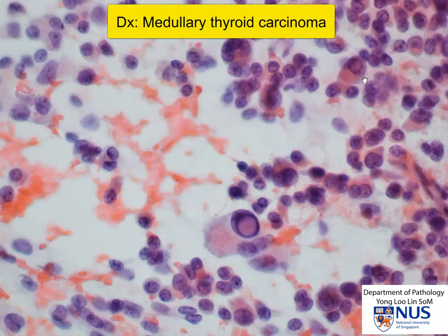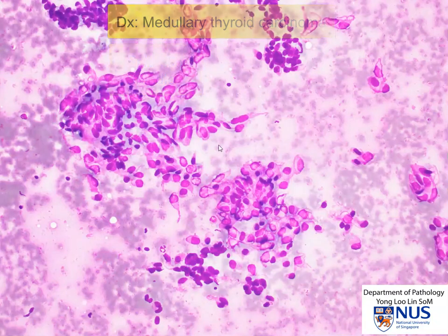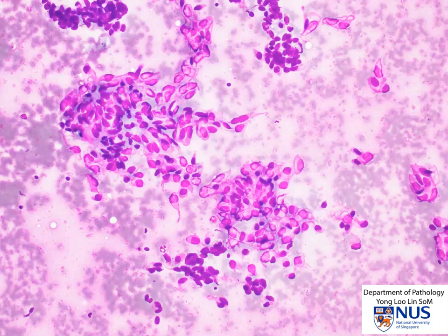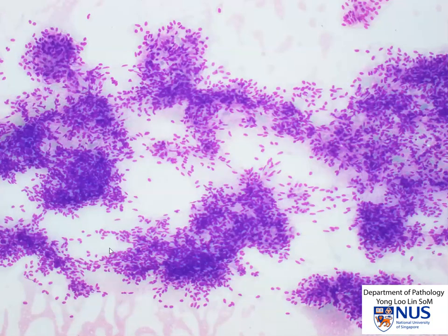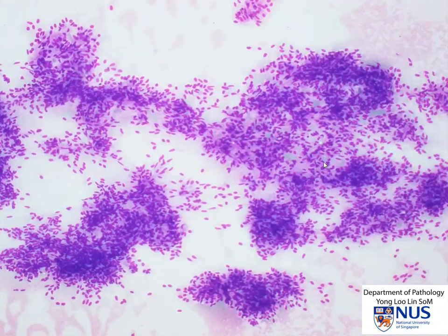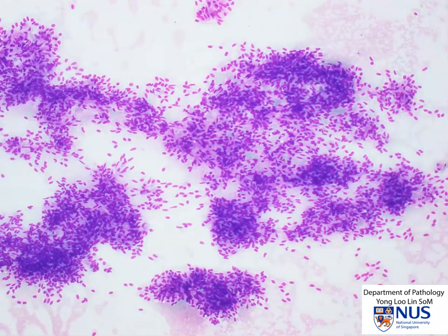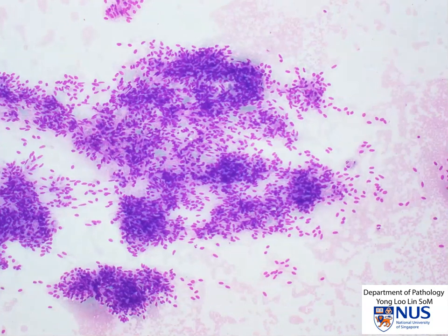Medullary thyroid carcinoma, in addition to epithelioid features, can also have a spindle cell appearance. Here is one such example — we can see that the nuclei are elongated and some of the cells have these tapering cytoplasmic processes. Here is another example of a medullary thyroid carcinoma with spindle cell morphology, and not infrequently we can sometimes see a mixed pattern of spindle cell as well as epithelioid cells.